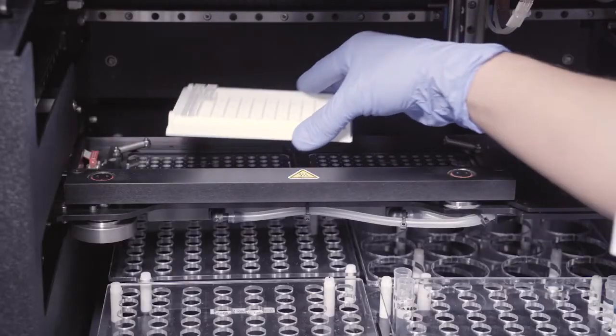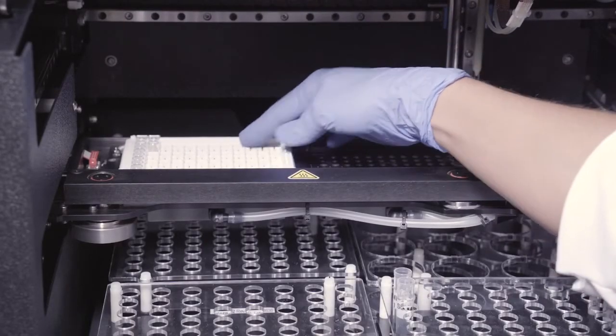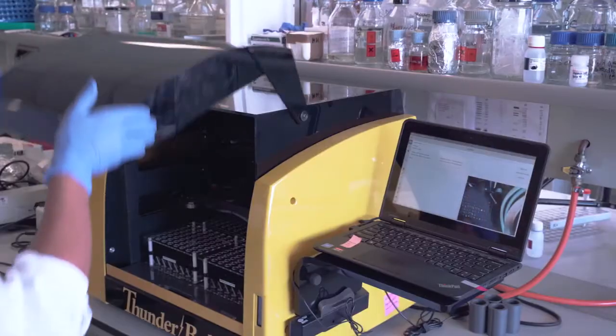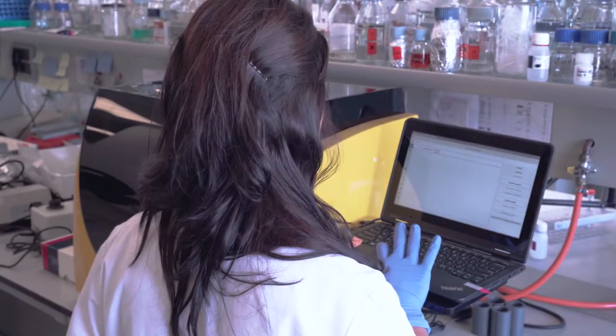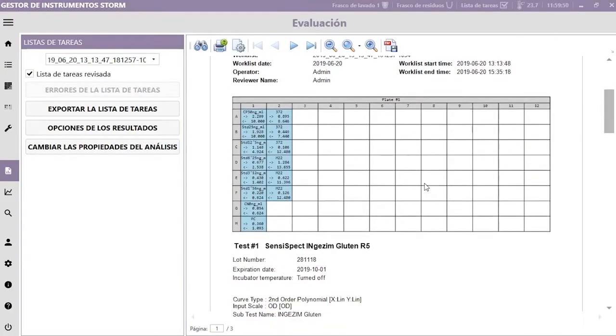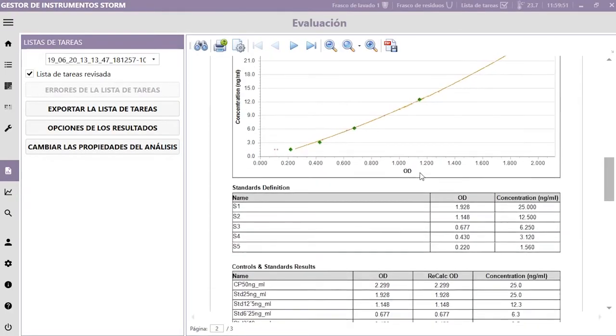Place the plate with the necessary wells and check that everything is correct. Press start button and let the machine perform the assay. When finished, you can see the results in a very friendly report with the calculations already made.